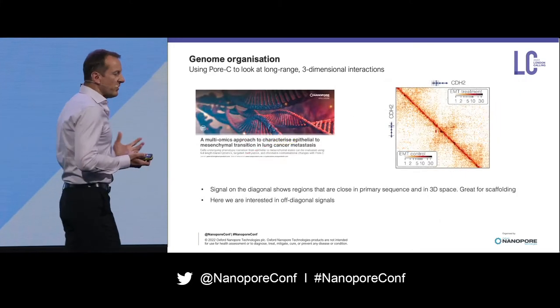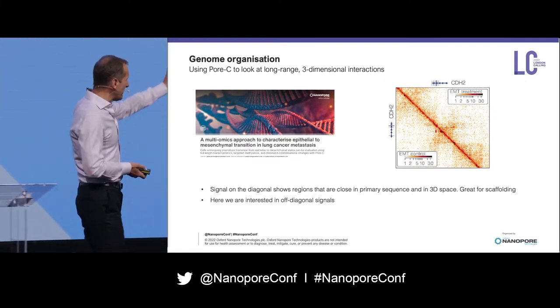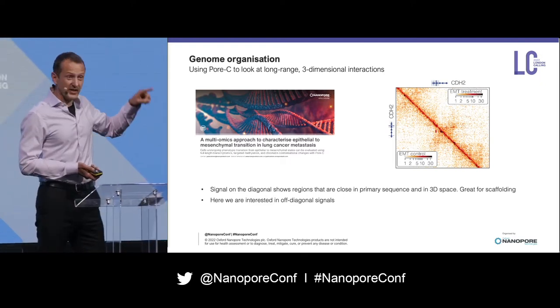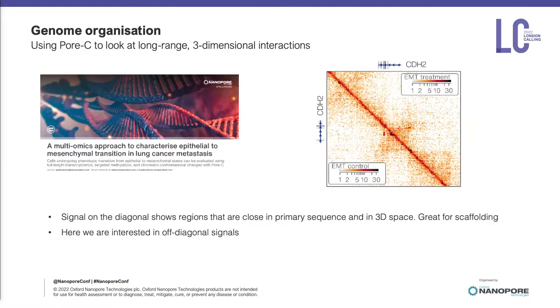But when we do this on our EMT cells, we plot a diagram like this. I mean, the labeling is possibly slightly simplified, but we have one genome against itself and the other genome against itself, one before treatment, one after treatment. And probably the most striking thing about the figure that you'll notice straight away is that there's this diagonal line going from the top left to the bottom right.